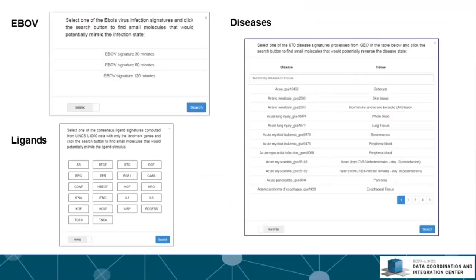The Ebola signatures are gene expression signatures measured at three time points after Ebola infection, and this is unpublished data from our collaborators. The disease signatures comprise of 670 disease signatures computed from GEO, and some of those signatures were extracted by the students of our last Coursera course Network Analysis in Systems Biology.